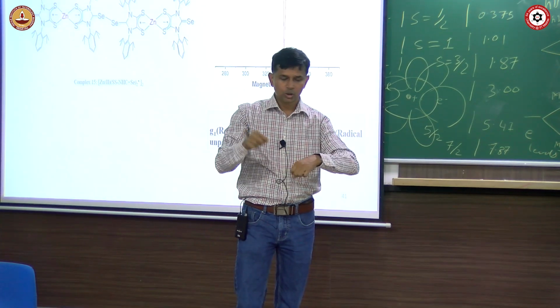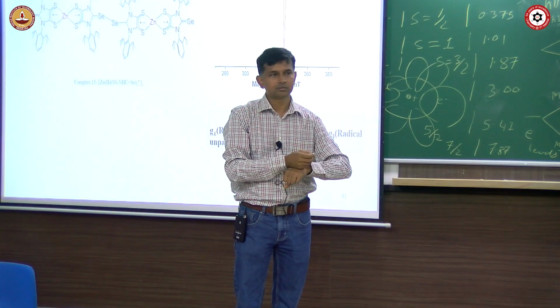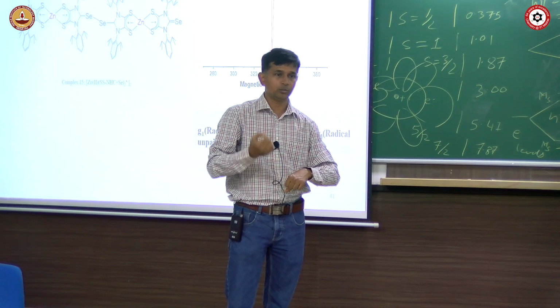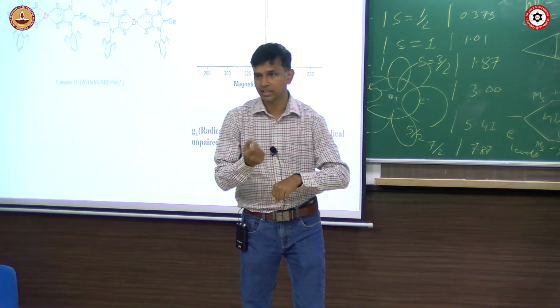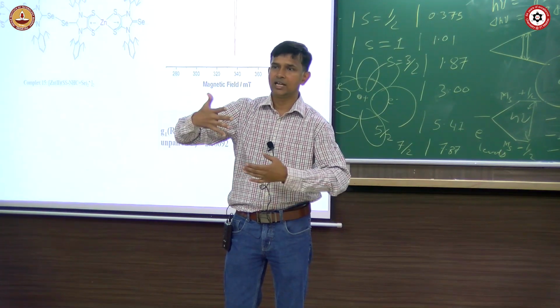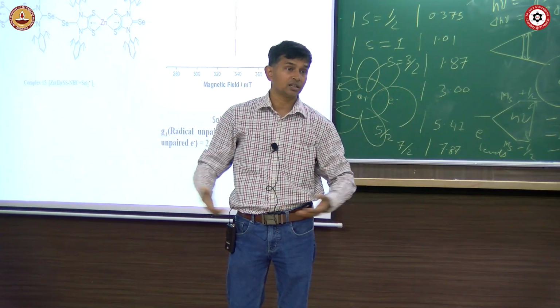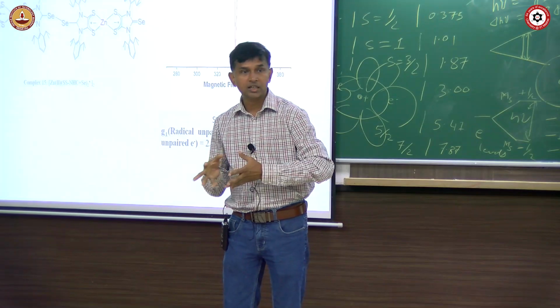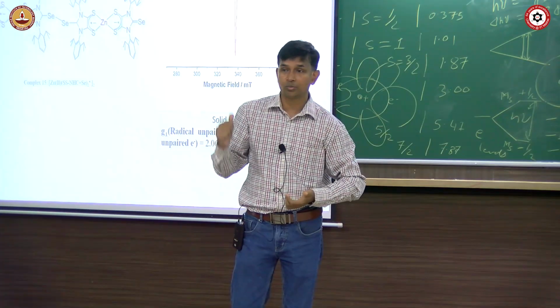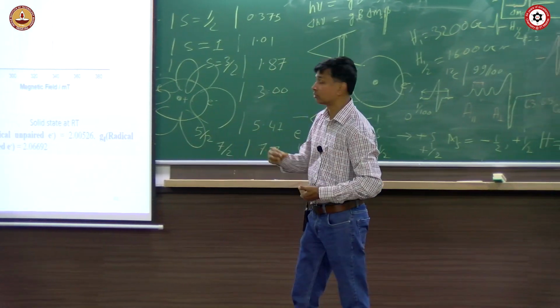It is like the feeling when you have a wound and you put a bit of salt on it, you feel it. EPR is like that. One effect you can put on another and you will feel it. Then if you put a little bit of chili powder, you feel it further. That is what EPR spectroscopy does, the effects add on each other, because they further split the energy levels and then transitions start occurring between them. So you have many more lines and their features will come. Now they can be symmetrical or unsymmetrical, and based on the shape, different features will come, and you can play with them in software, simulate them and speak about who is who, which one, how much, what exactly you can quantify.